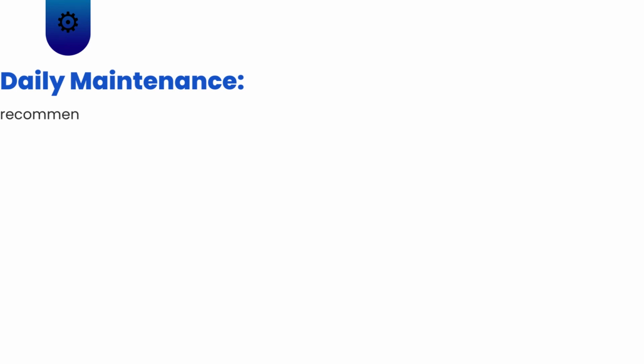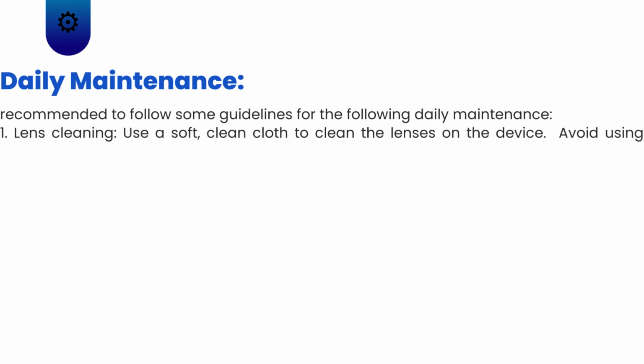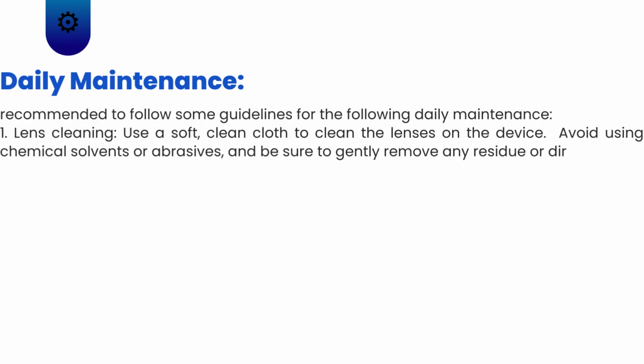It is recommended to follow some guidelines for the following daily maintenance. 1. Lens cleaning. Use a soft, clean cloth to clean the lenses on the device. Avoid using chemical solvents or abrasives, and be sure to gently remove any residue or dirt.